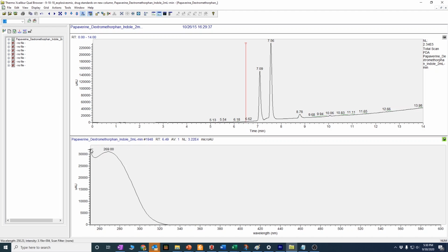Is it taking it from here, here, here, here? And the answer is, if we look at the peak here, it's taking the top intensity in the spectrum, and it's plotting that on the y-axis here. But there are different ways to display the data, and this can be really powerful.